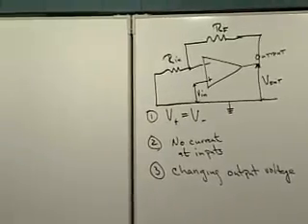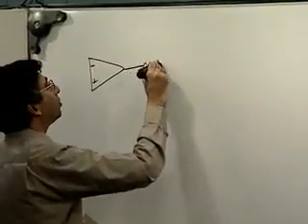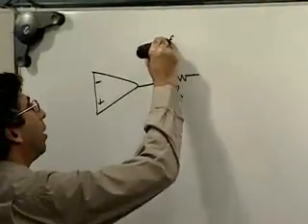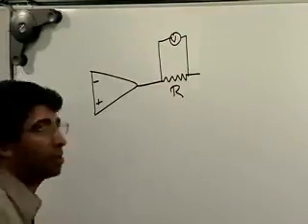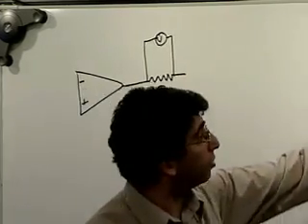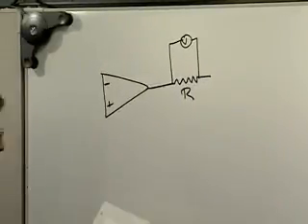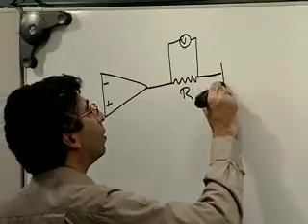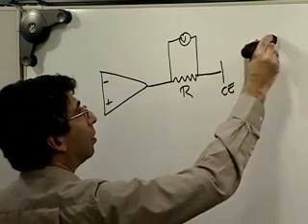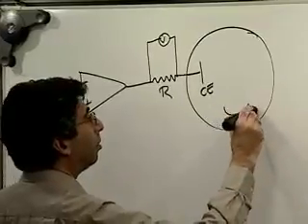So we take our op amp. Going to drop an extra little resistor in here, which is a precision resistor R, and take a precision voltmeter and drop it across that R. And now, if there's a current that flows here, a current is allowed to flow here. Remember, our rule is there's no current over here. So if we have a current flowing out of our op amp, we can measure it. And so I'll connect that to my counter electrode. Here's my electrochemical cell right here. I'll have a working electrode over here.